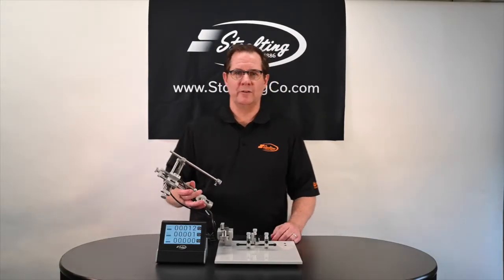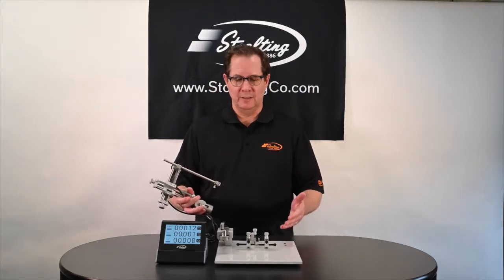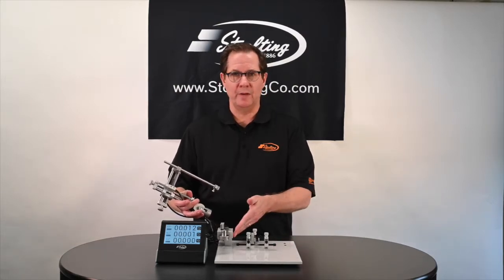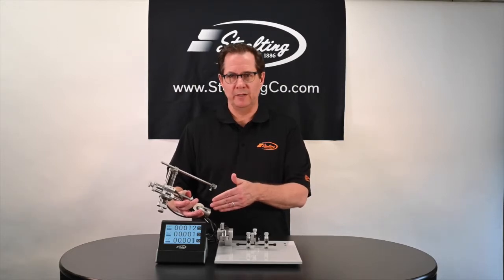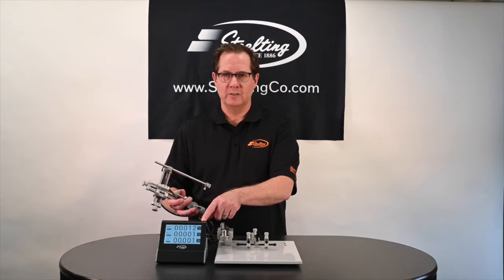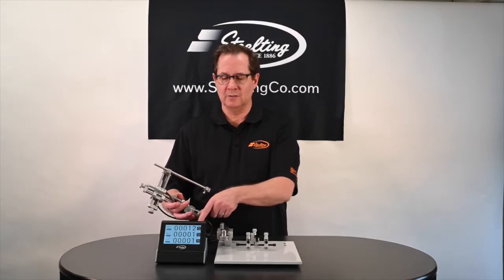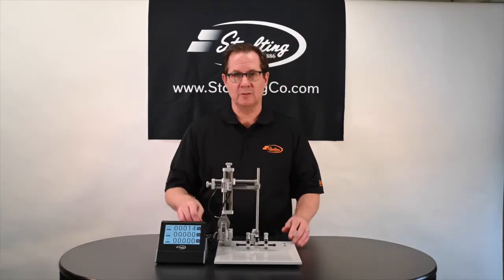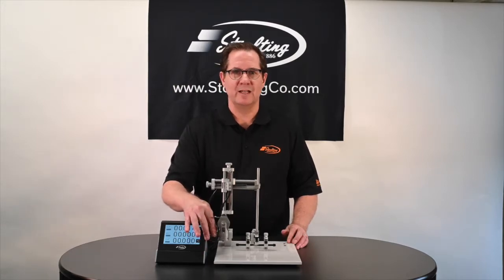Once you've received your Stereotaxic Instrument, it's quite simple to assemble. All you have to do is open up the box. You'll have at the bottom of the box this base plate with the AP arm already mounted on it. In a second box, you'll have the digital manipulator arm, and in a third box, you'll have your digital display. Simply attach the connectors back into the back of the digital display, and take your manipulator arm and mount it directly onto the AP drive and tighten down. It's that simple.